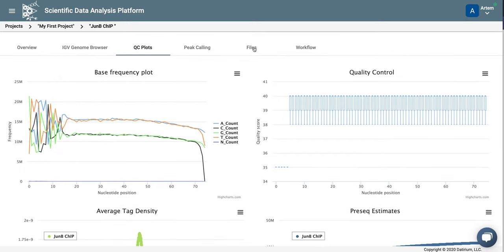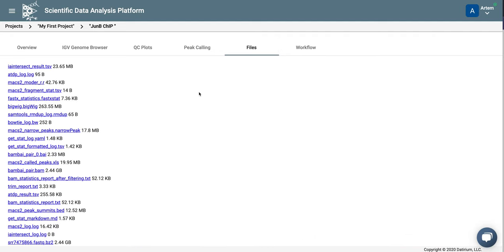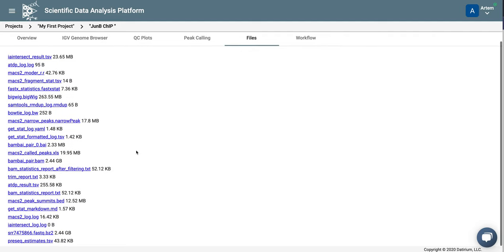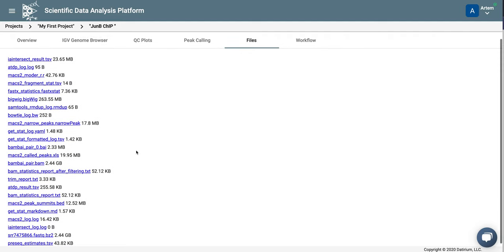Finally, let's look at the file tab, and this is where you can download all the data files. So this includes, for example, the FASTQ files, the BAM files, statistics files, list of the peaks, and so on.